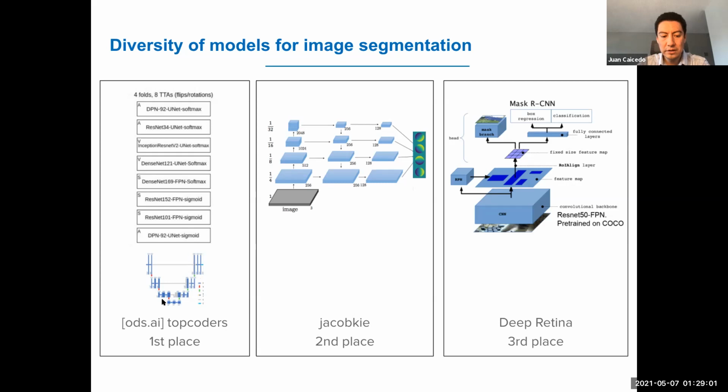It's an encoder-decoder architecture with skip connections between the multiple resolutions. You can share information from the input or the encoder path all the way to the decoder. So they communicate, basically by copying information from one to the other.